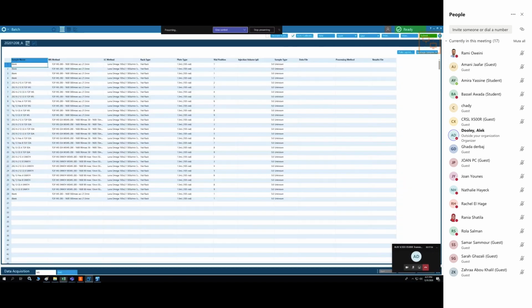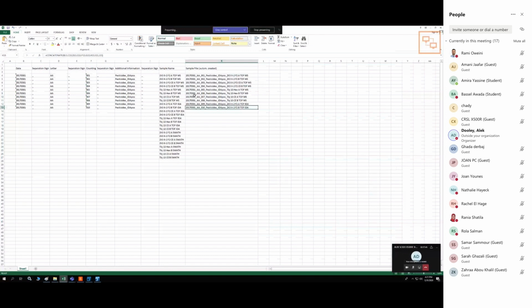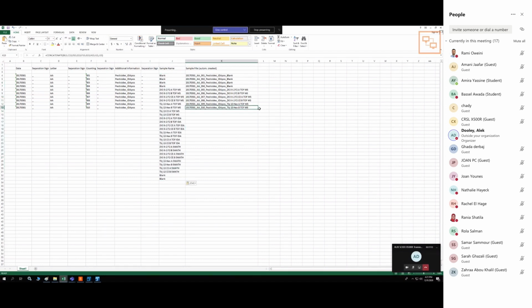Let me grab the sample names. I'll copy that to Excel. And then I'll put here. Great. Okay, and we just need to fill this down. And today is, wow, 2017. That's a long time ago.